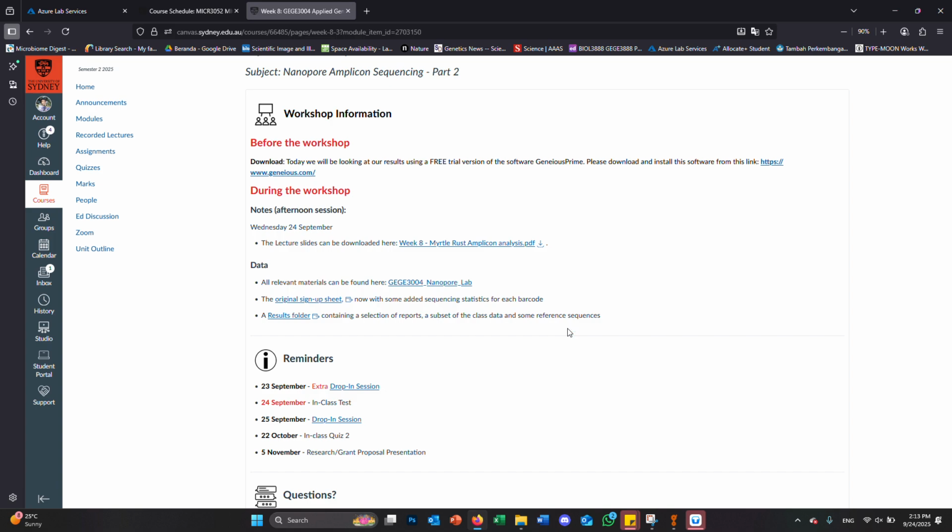Okay, so we have the sequencing report that you can download here. So in the Canvas page, if you would like, or even if you've got these lecture notes open, that link should work. It should take you to the Google Drive folder that we had last week with our results, and you can download the sequencing report. It's an HTML file, which you have to download.